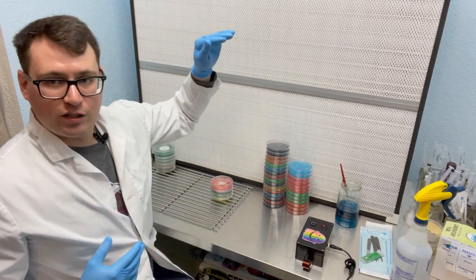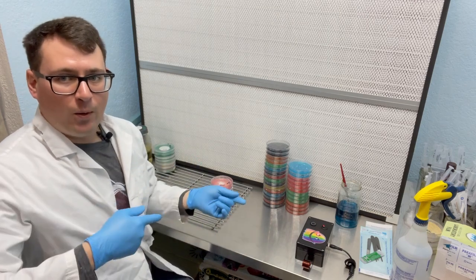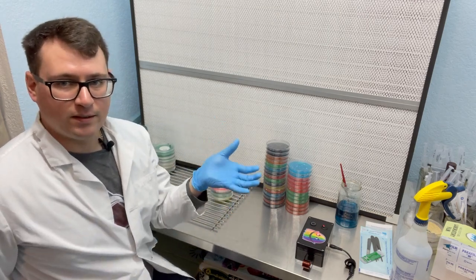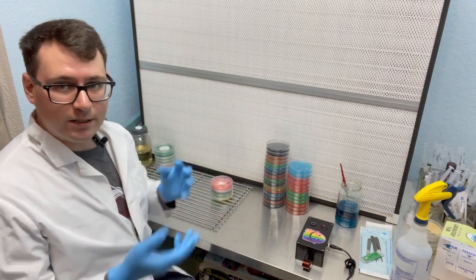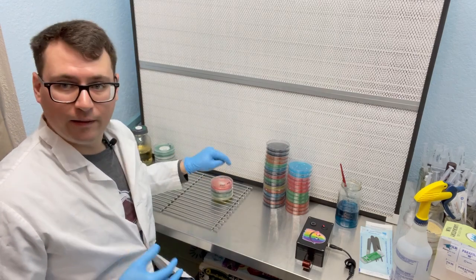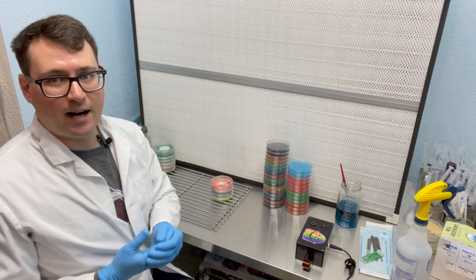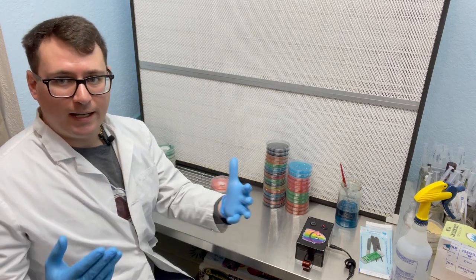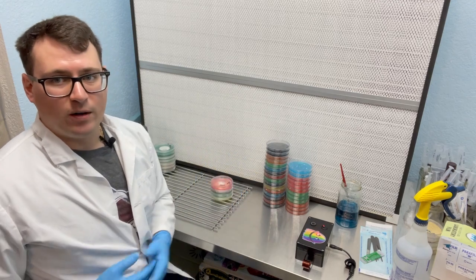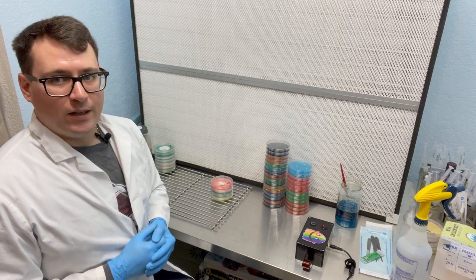I'll just go through, flip the camera around, and then I'll do a follow-up video with the results. Hopefully we don't see any contamination. Hopefully there's not intermingling between the two different types of mycelium. I hope that makes sense to you guys. Sorry if it was a little bit long-winded, but I think that explaining everything up front will make more sense as you see the follow-up results of this video.